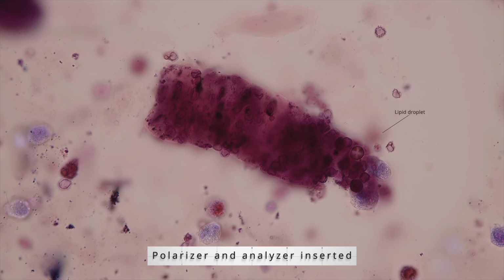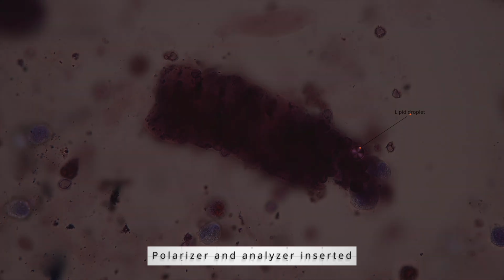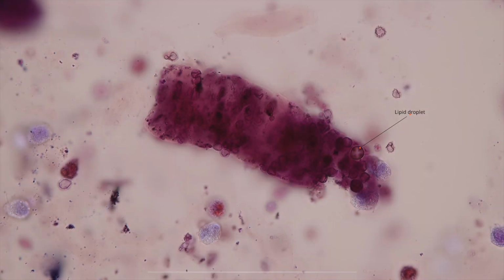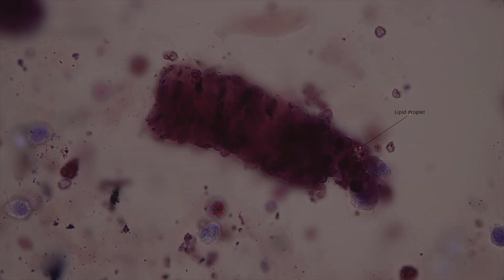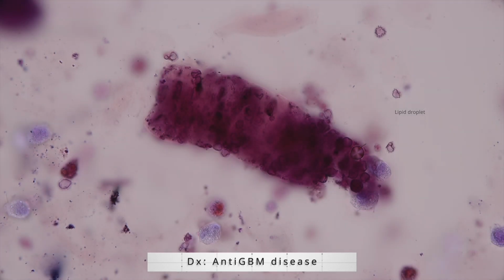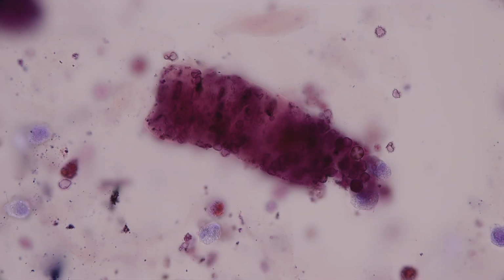Now we can see what looks like a very clear Maltese cross pattern. When we rotate the polarizer, it's clear this is a lipid droplet. So what initially looked like it might have been a red blood cell under polarized light is lipid. The diagnosis in this case turned out to be anti-GBM disease.